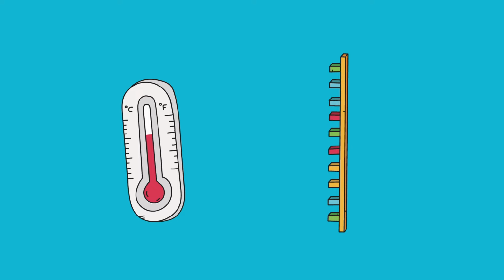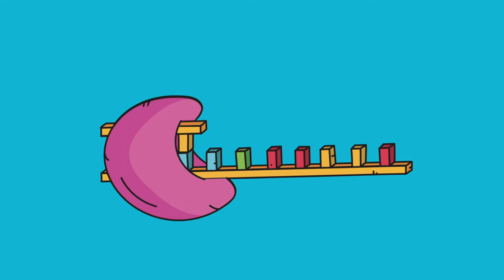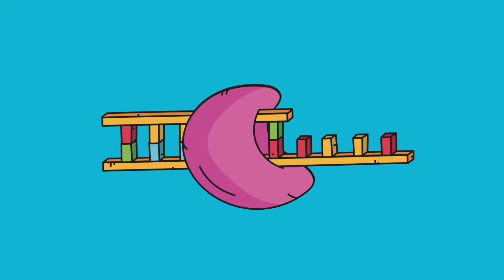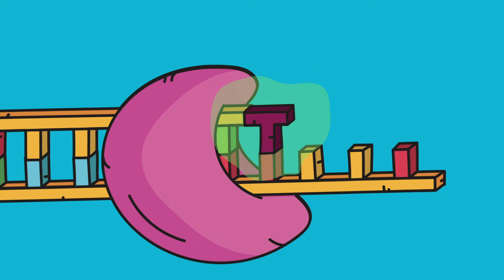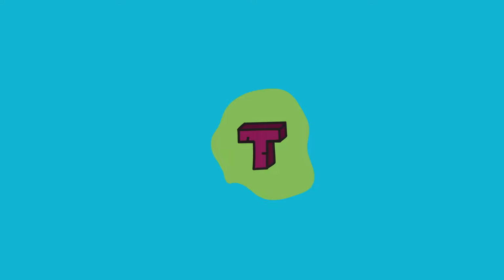The DNA polymerase enzyme then lengthens the strand according to the DNA template until it randomly places a dideoxynucleotide. The dideoxynucleotide is missing the hydroxyl group, which allows the next nucleotide to bind. So once it is placed, the chain is terminated and will not grow any longer. The color of the fluorescent dye on the dideoxynucleotide represents the last base which was added to that fragment.